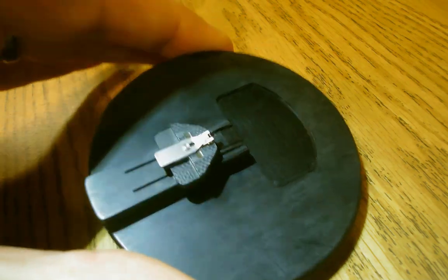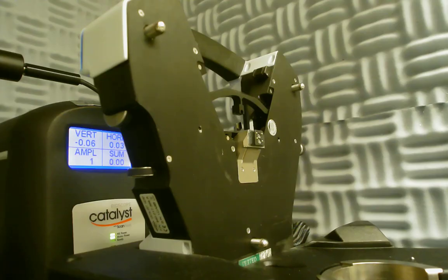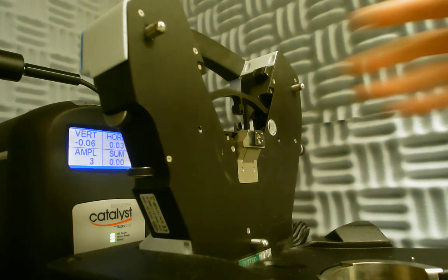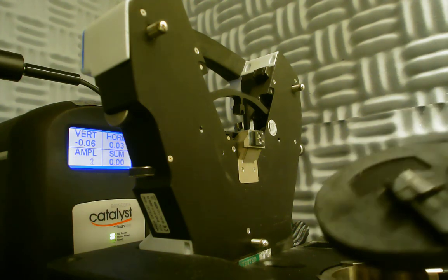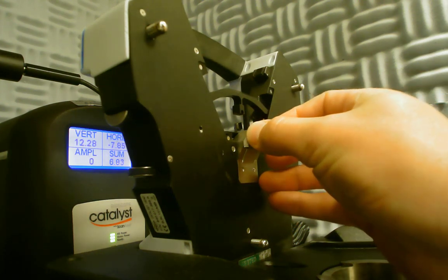I've mounted a tip here and I'm going to remount a new one without the camera in place because it's kind of difficult to get in there. Then we can begin setting up our AFM for imaging. Now that we've connected to the instrument and the laser is on, we can mount the tip holder onto the cradle and align the laser onto the cantilever. The tip holder just goes into a dovetail joint on the cradle.